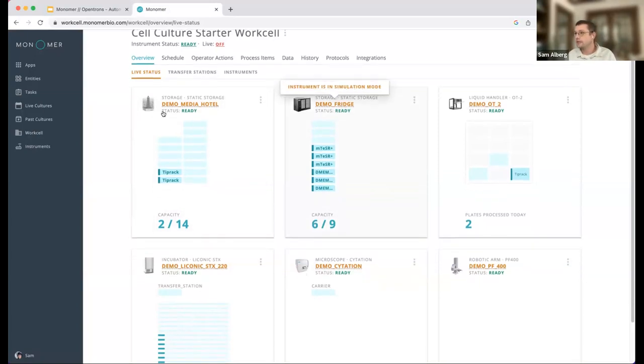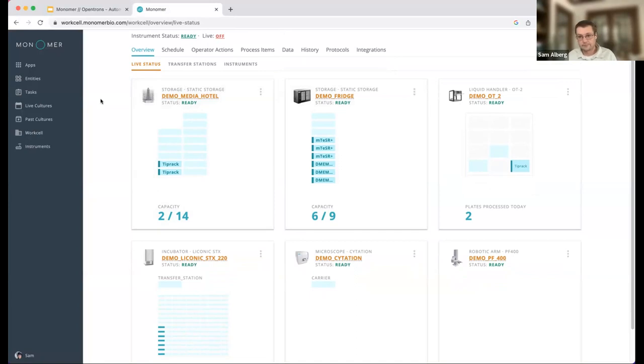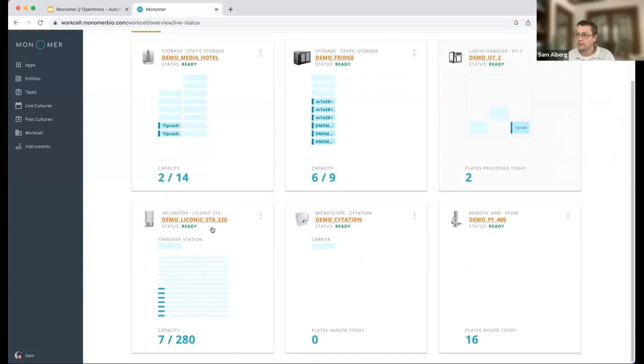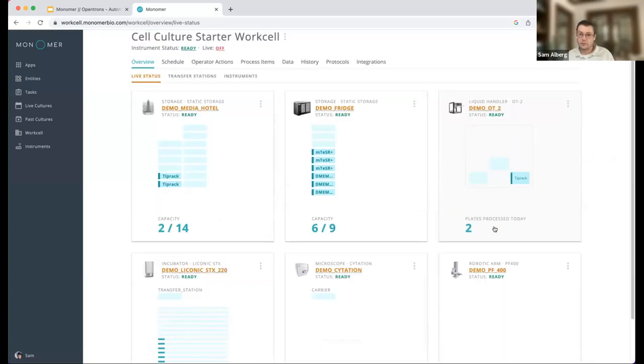What you're seeing in front of you is an overview of the work cell. We've created an interface for each of these instruments that's involved in this work cell. This is the example of the Science Corporation work cell. We have media hotels, which are storing things like tip racks or extra reagents, a fridge, which we have loaded with various plates of mTeSR and other media, the Opentrons deck with an interface and a tip rack preloaded, and then our incubator, our microscope, and our robotic arm. As we schedule experiments in the software, this will animate, and you can track the progress and the processes being performed from this screen.